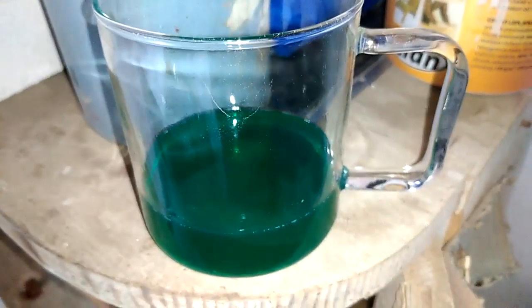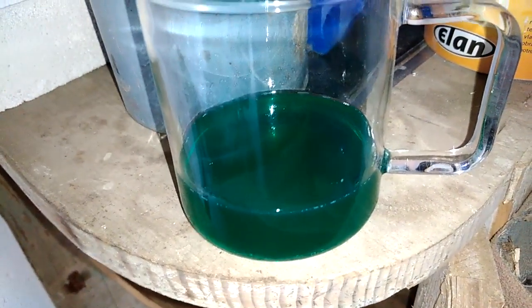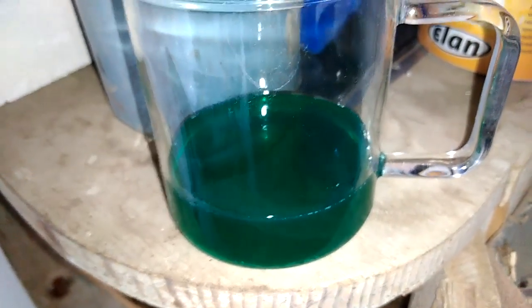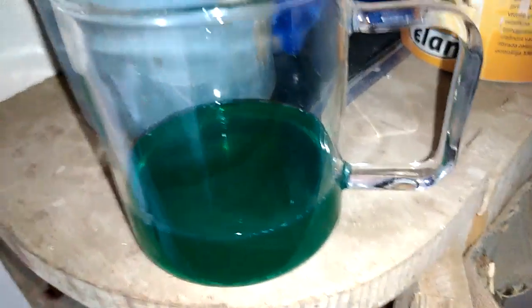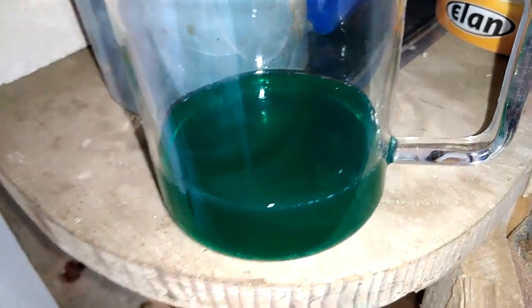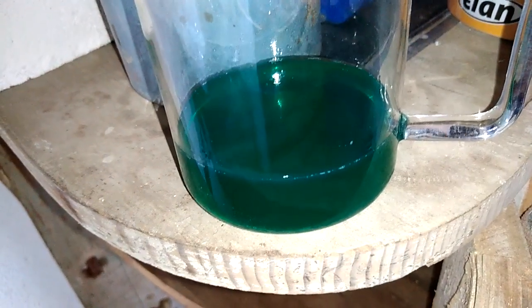Hey guys, in this little beaker I got the filtered solution from my fuses — these little silver fuses. Right now I will drop some — I got some table salt without iodine. I don't expect too much silver, just a little amount of silver chloride.